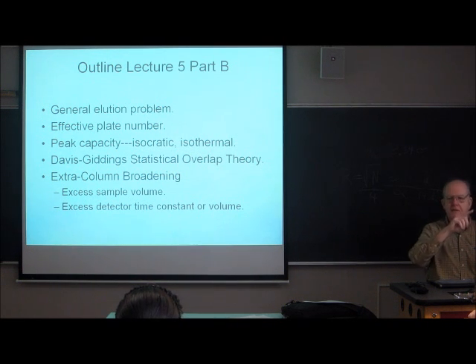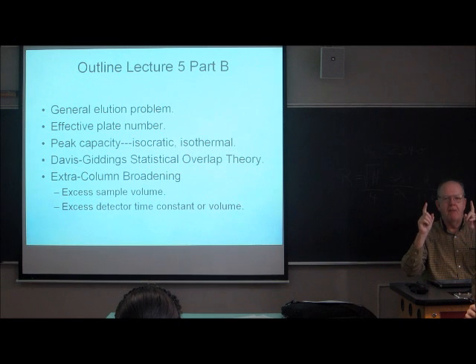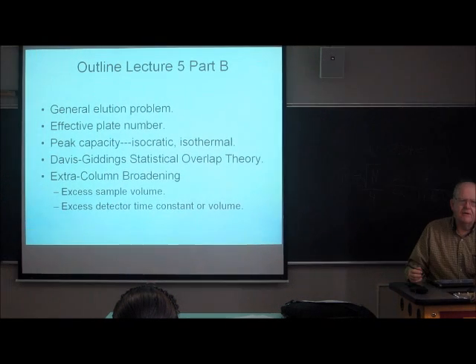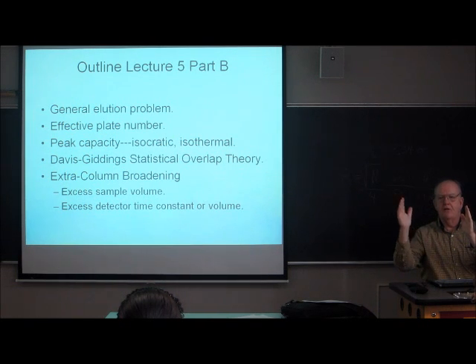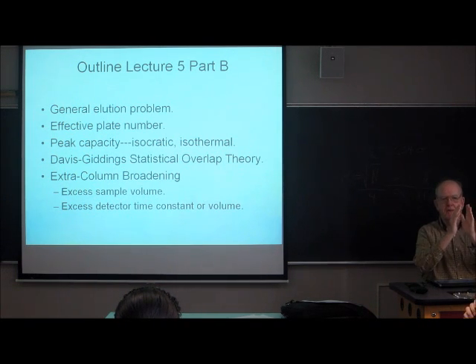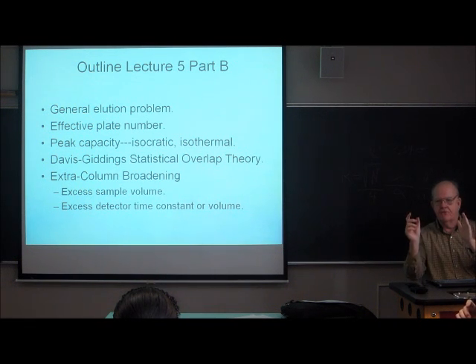So between volume 1 and volume 2, or between time 1 and time 2, what's the maximum number of peaks that are equally well separated that you can fit in that space? Sort of the flip side of peak capacity, because in peak capacity, we assume that the peaks are equally well resolved. And so the elution sequence, the band spacing, is highly controlled.